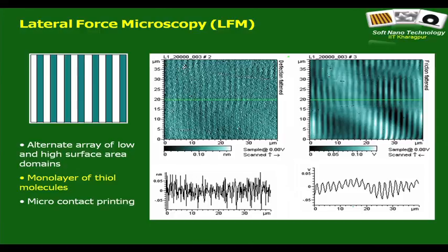And typically, if you look into an AFM scan, you will find that there is a window which gives you the frictional map, the frictional image, and this is nothing but the lateral displacement or the lateral force. So, what you are in fact seeing is a very interesting image. This is in fact the image of a micro contact printed surface.